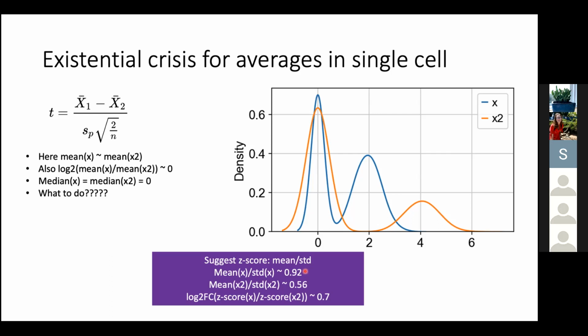I want to make a quick statement. I don't have this on the slides, but just in case you're confused: statistics tells you whether two gene distributions are different. It does not tell you how those two gene distributions are different. So that's why we use Mann-Whitney U. We know that they are different, but we don't know how.